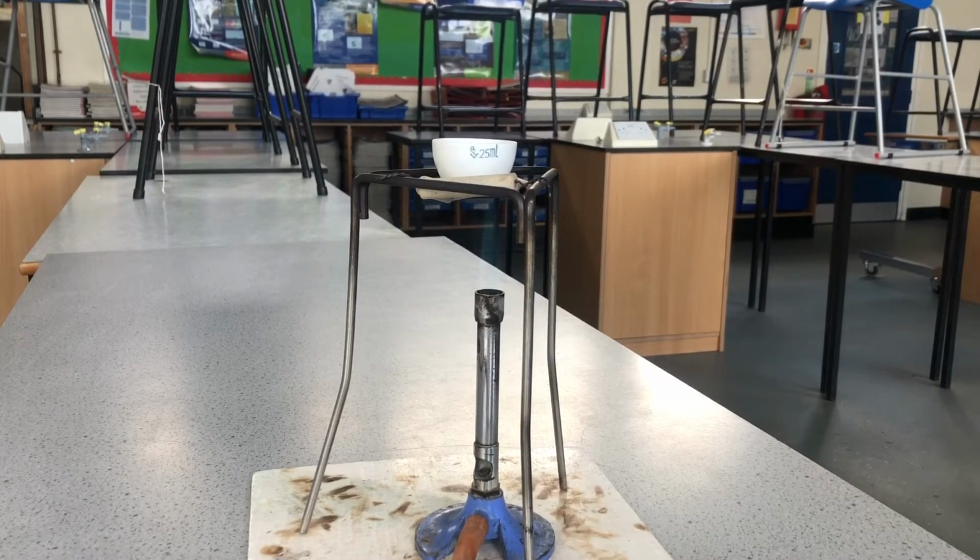We'll know when it's gone, because the magnesium ribbon will turn to a white powder. We might even, if we're lucky, see it go. Certainly if we had a lid on, we wouldn't see it. Without the lid, we might see it. I might pause the video rather than make it overly long, so we'll come back to it in a few minutes once it's wiped out.